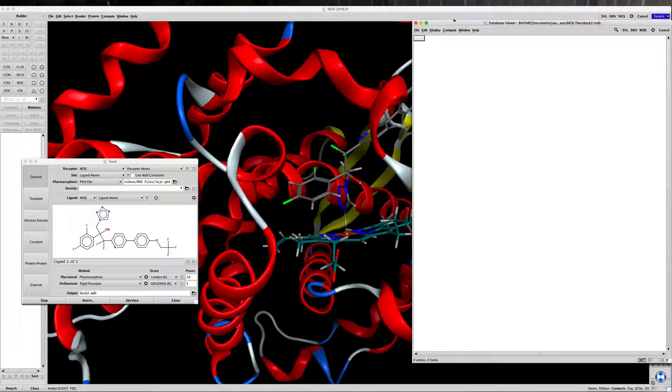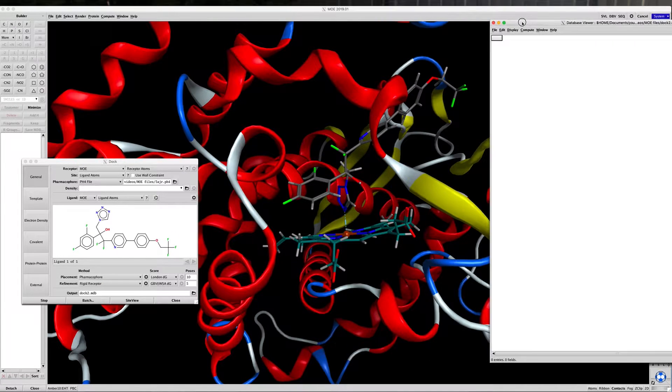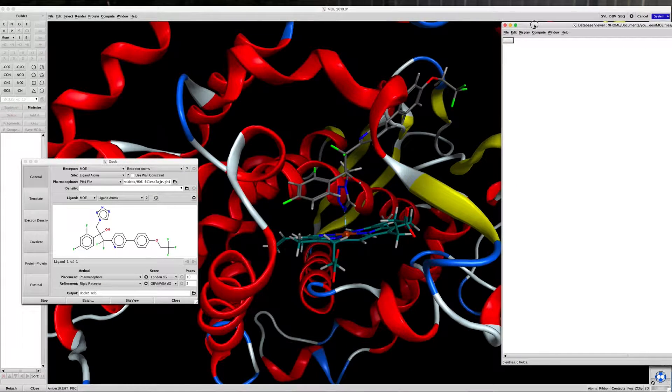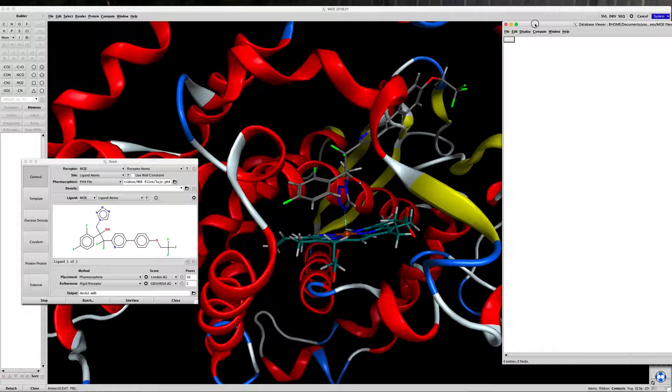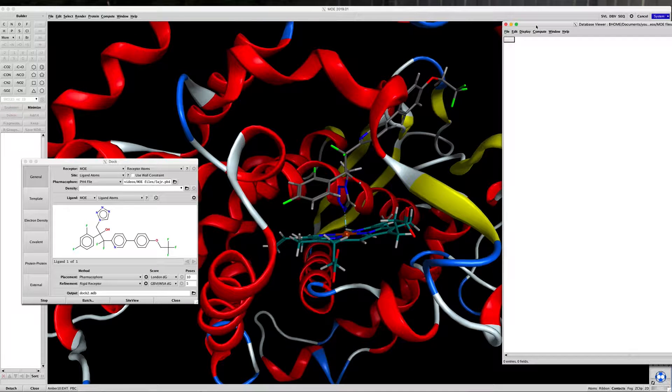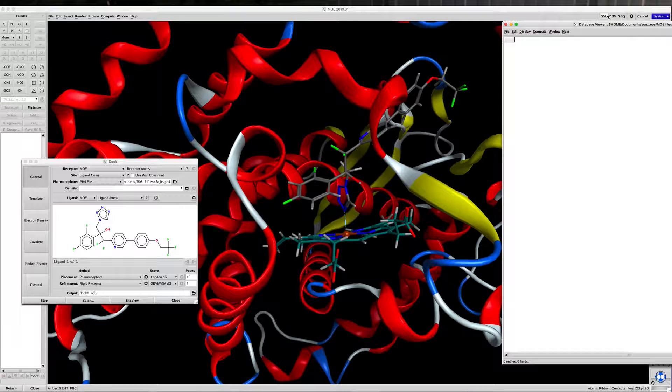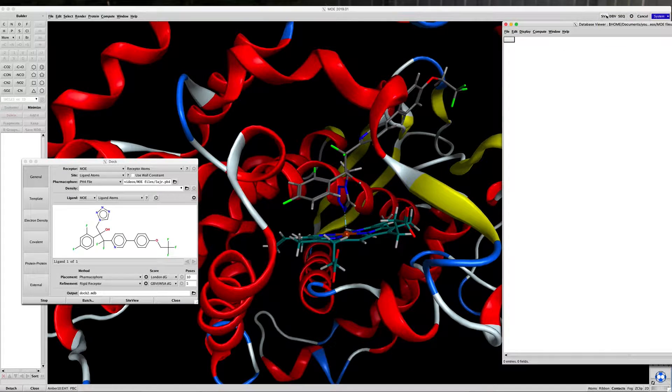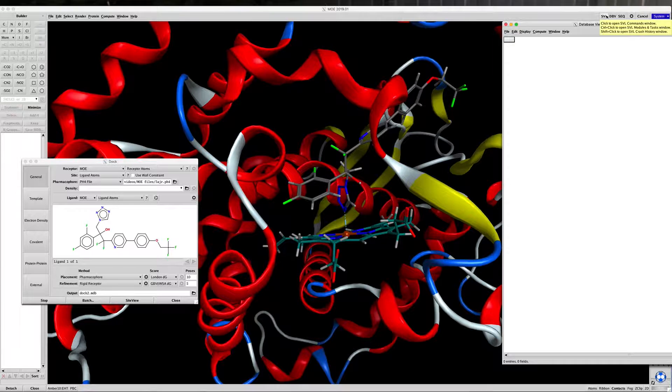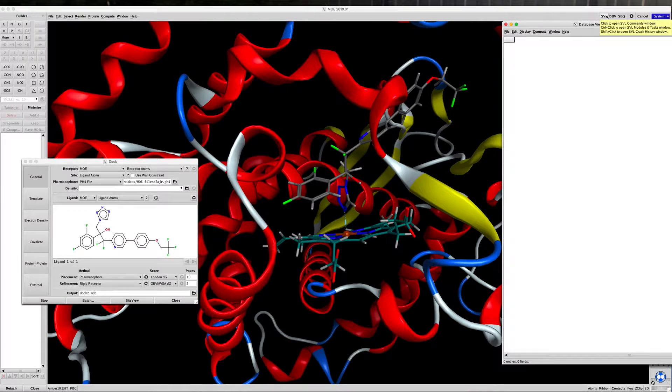The database viewer window opens, and that will give us the results when they are generated. Just click on the SVL window.